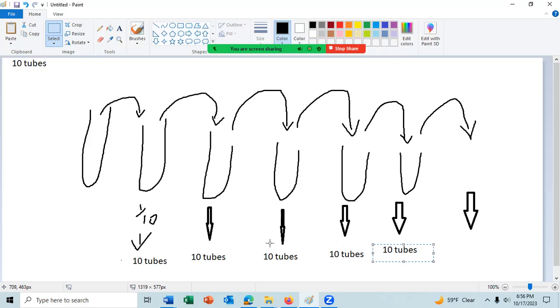And if this was the one that had it, then these would have 0 cells in all 10 of the tubes. But this one here, he would then use that growth in the one tube as a pure culture. And he was correct in most cases. That was a pure culture. However, this is a very laborious way of getting a pure culture.